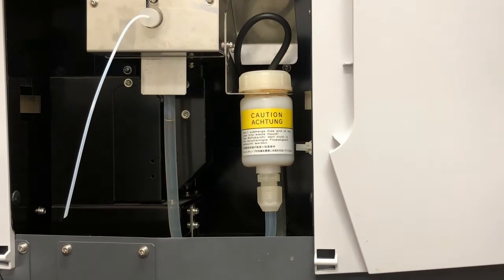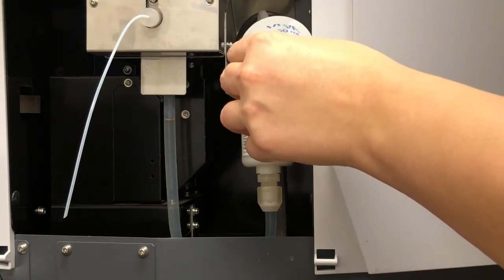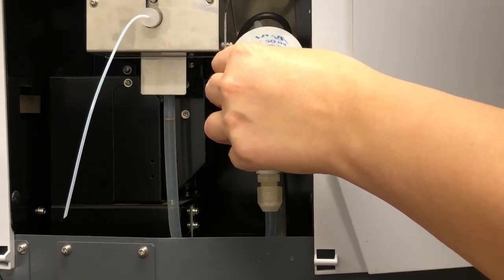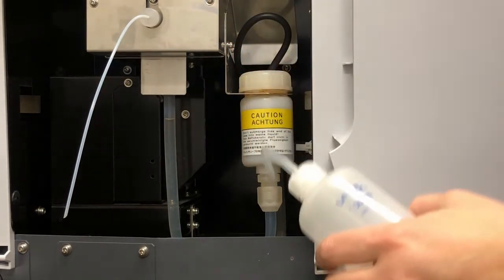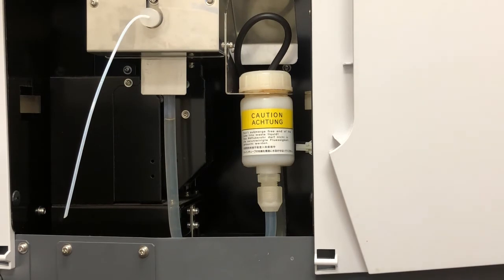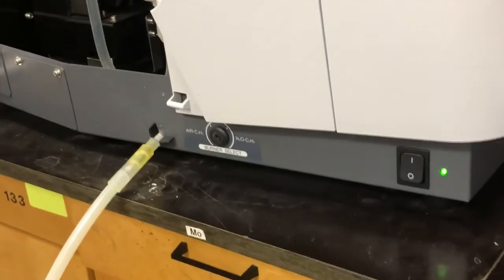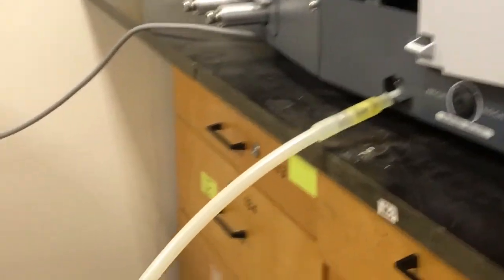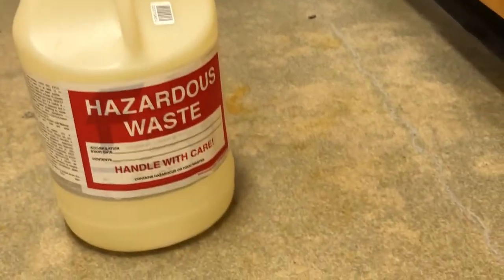The other thing that's important in this step is that this bottle is full of water. So we just fill it up with deionized water, and we can tell it's full because when it's full, we'll see some of the water pour out of the overflow here. Okay. Now, this drain sensor, it's also connected to a tube here that goes down to a hazardous waste bottle, okay?